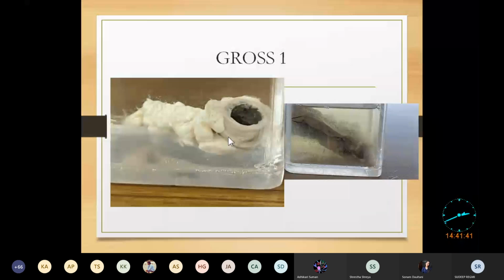Here you can see that the tubular appendix is dilated. It has congested blood vessels, which are seen here. Externally it is gray, and there might be some exudates overlying the serosa, and there is a dilated lumen which contains fecalith. So this is about the appendix.